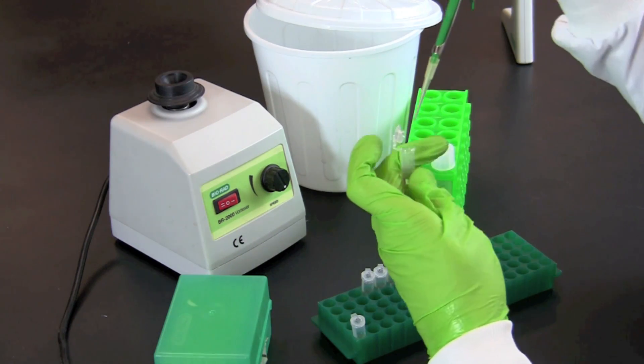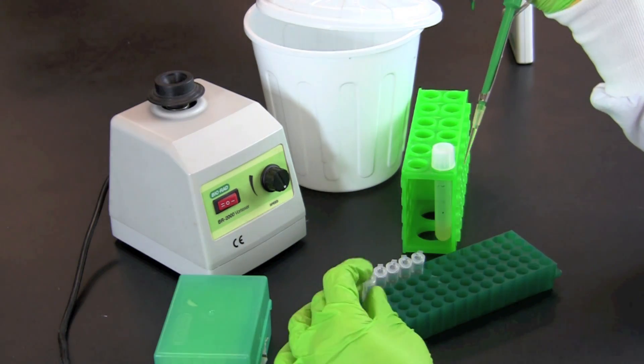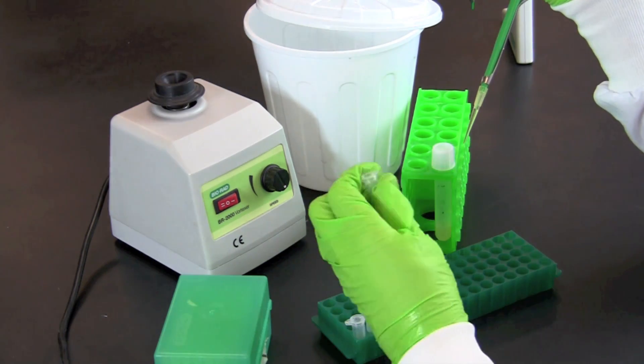Continue to serially dilute the bacterial culture into each consecutive tube until the tube labeled 10 to the 7th is used.